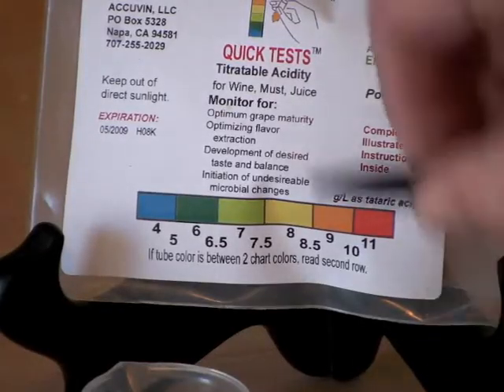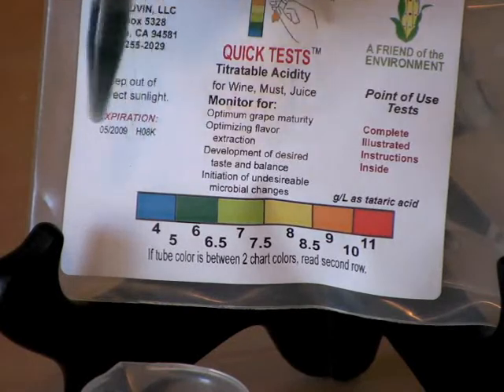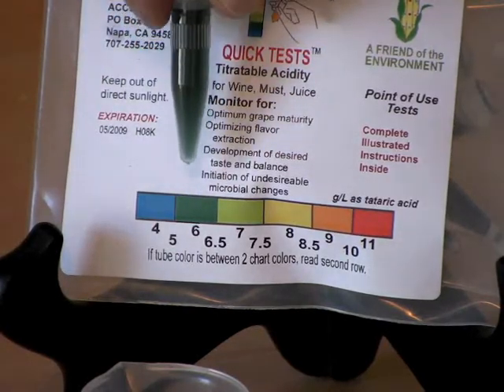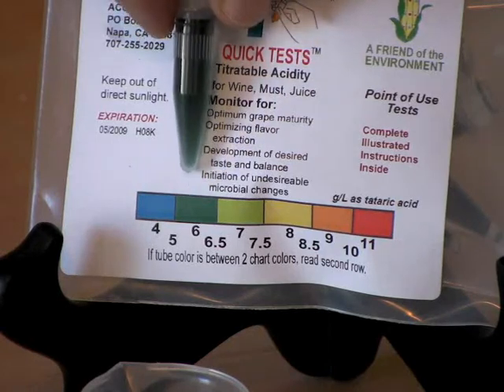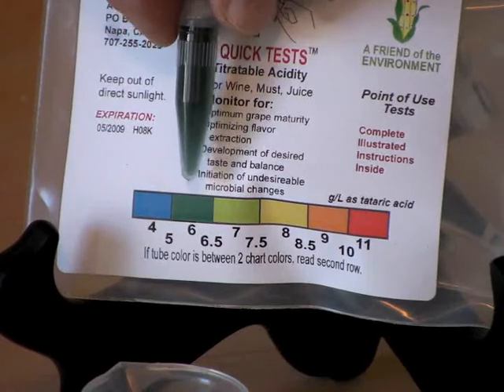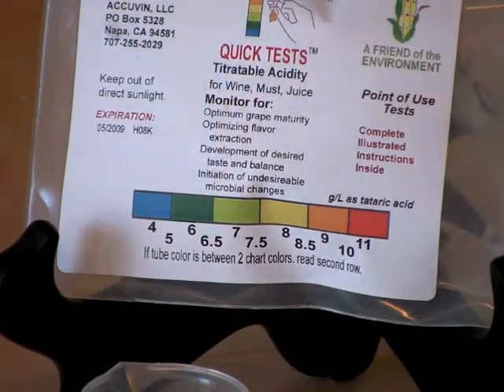To determine the TA level, we'll match the color in the tube to the color chart. The color in this tube is green. It corresponds to a TA level of 6 grams per liter, or 0.6%. That's it.